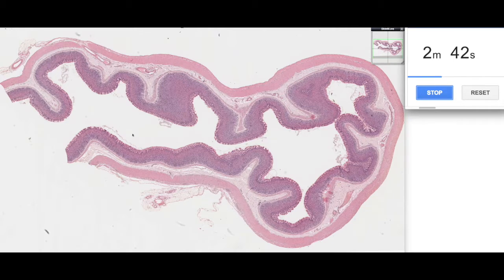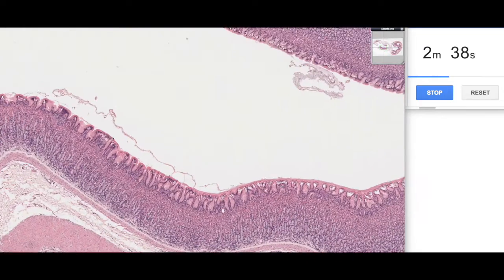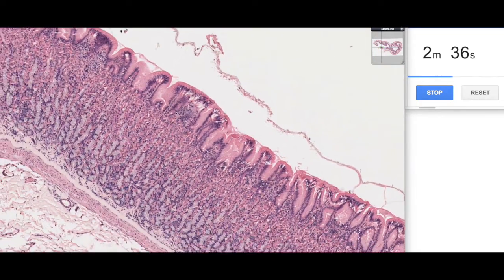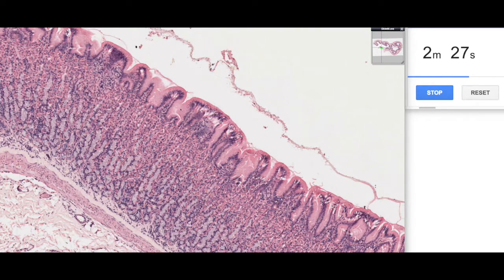We can tell it's the body of the stomach if we have a look at a little bit higher magnification of the mucosa here. The first thing you'll see is there are only little depressions — only about 10 to 20% of the entire mucosal depth is made up of these depressions — and these depressions are the gastric pits.